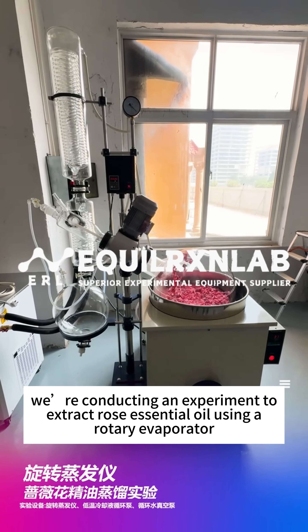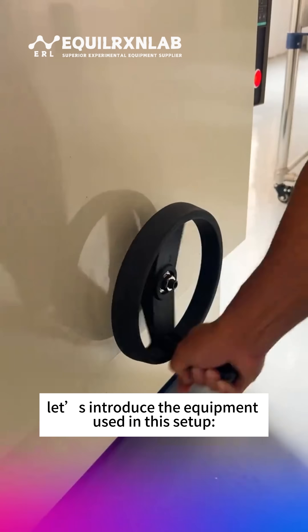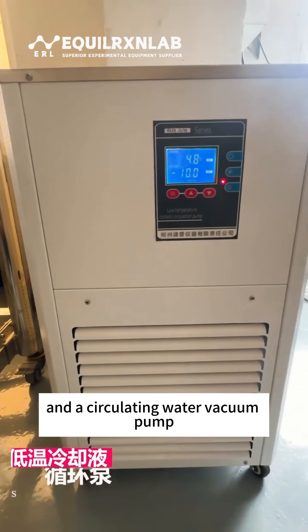Today we're conducting an experiment to extract rose essential oil using a rotary evaporator. Before we begin, let's introduce the equipment used in this setup: a rotary evaporator, a low temperature cooling circulation pump, and a circulating water vacuum pump.